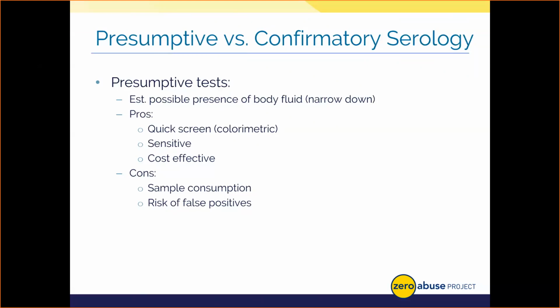Let's talk about then other challenges with presumptive tests. Other concerns are that presumptive tests do require consumption of some of the sample, so you need a sufficient amount to test and plenty left behind in case you need to run DNA on the item. You also can't run DNA on an item that's been tested with these chemicals. It does in essence consume the sample because the chemical reaction from the test renders the small sample processed unusable for other tests, including DNA. Thus, your discretion as an analyst again comes into play with serological testing. Do you test for a body fluid if it means less sample for a confirmatory test or even DNA testing?